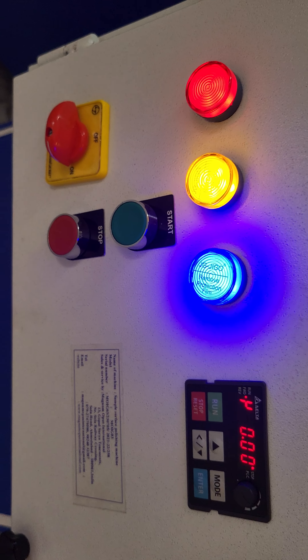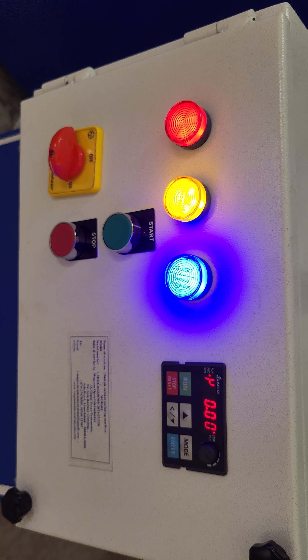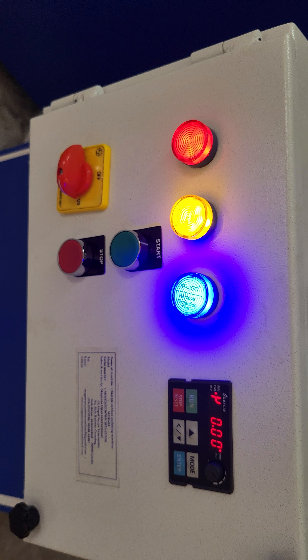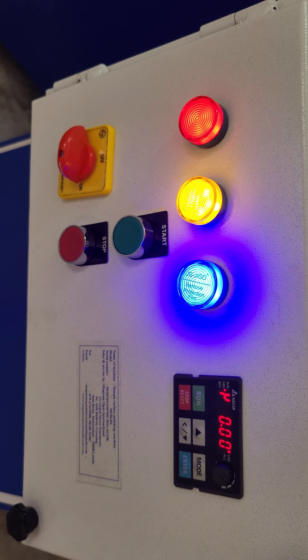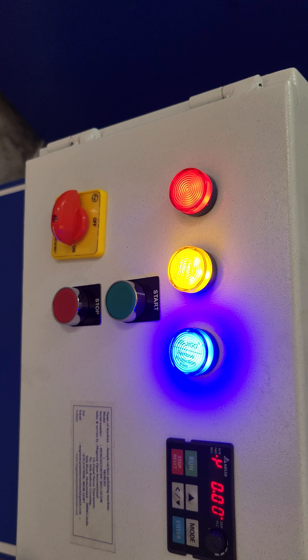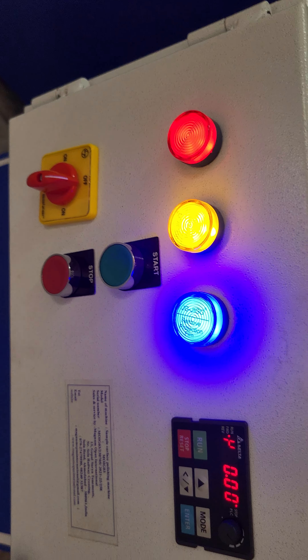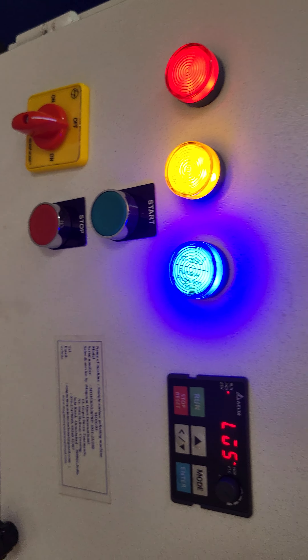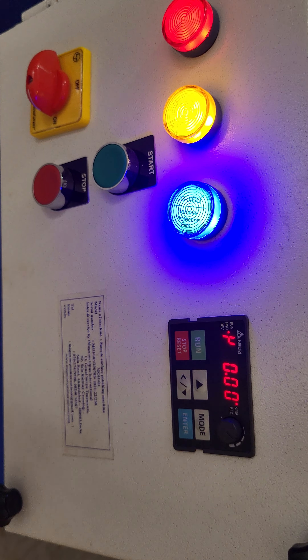Here is a closer look at the variable speed single disc polisher machine. The front panel looks like this. Once you supply three-phase power, all three indicator lights will glow. The second step is to switch on the machine.